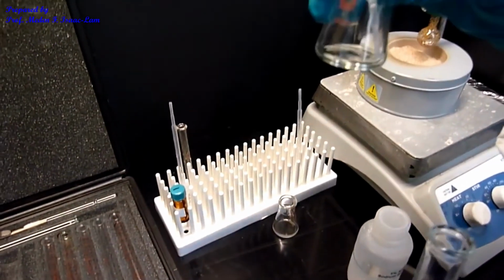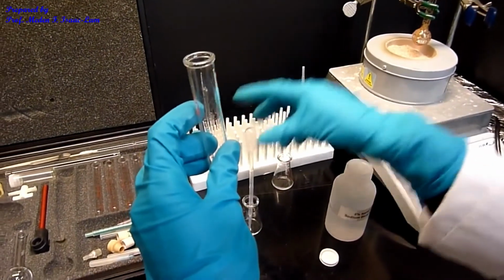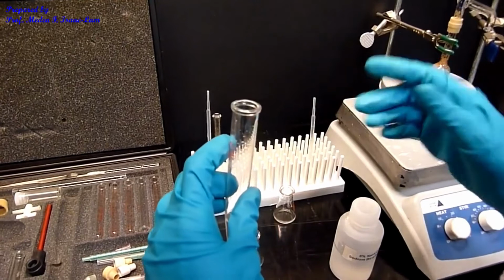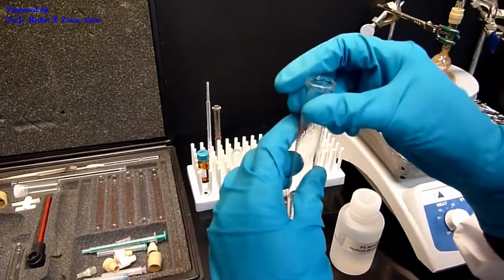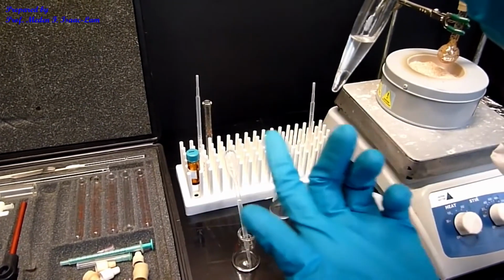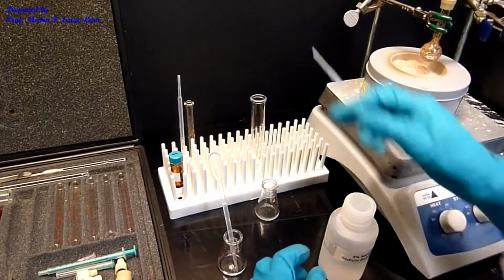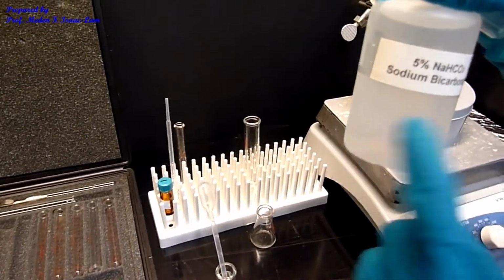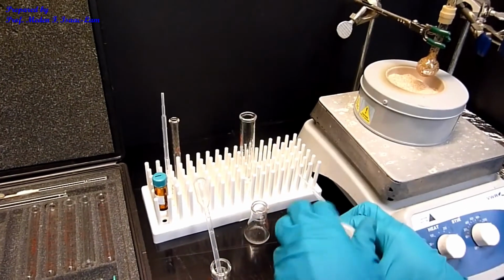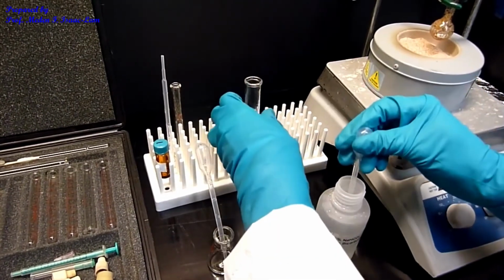So I transferred the distillate into the conical tube using a pipette, and I did not really combine the first fractions. Although when you waft it towards your nose, it actually smells like ester, but I just want to get the higher boiling component, which actually distilled at about 90 degrees C. So now I'm going to wash this with sodium bicarbonate to get rid of any acid or acetic acid that actually co-distilled. I'm just going to add 2 mL of the sodium bicarbonate solution, aqueous 5%.